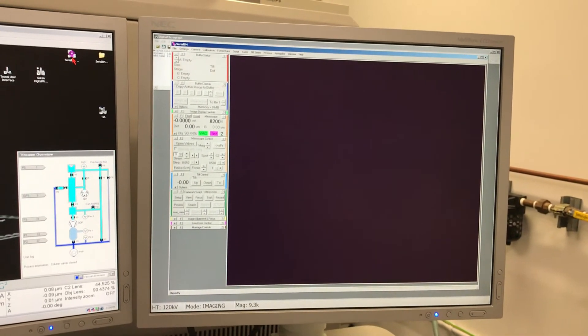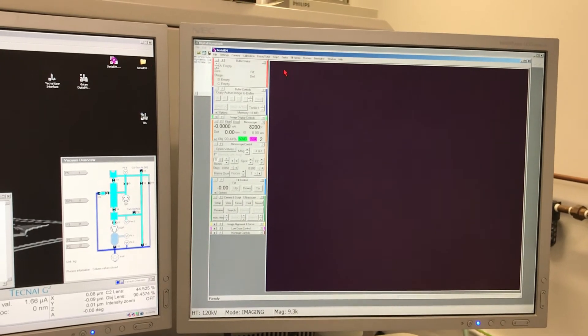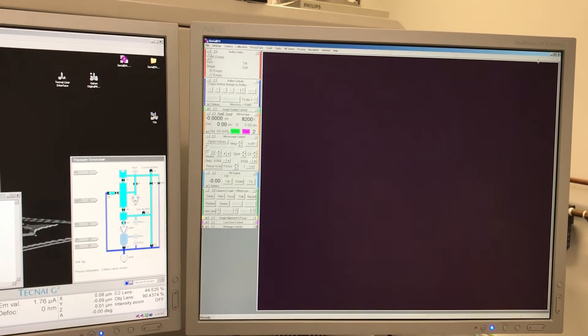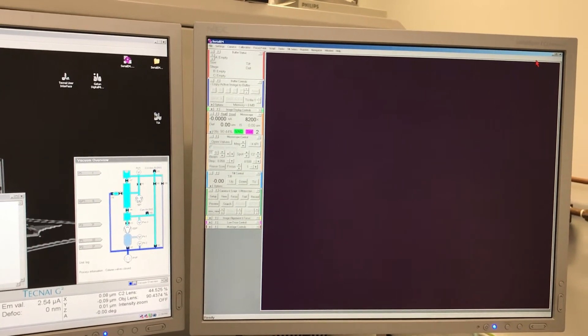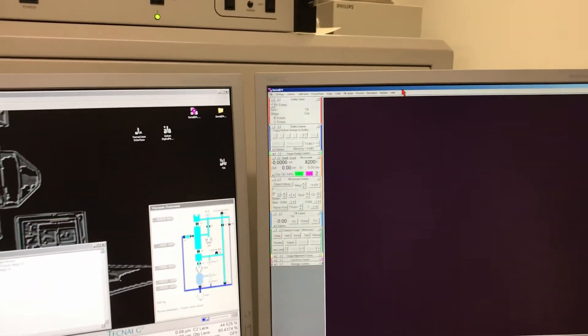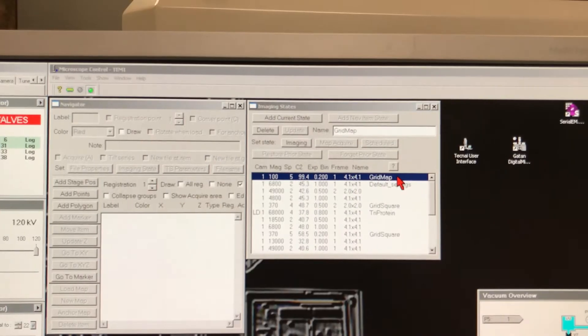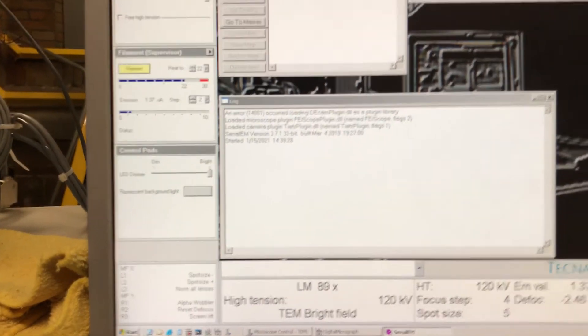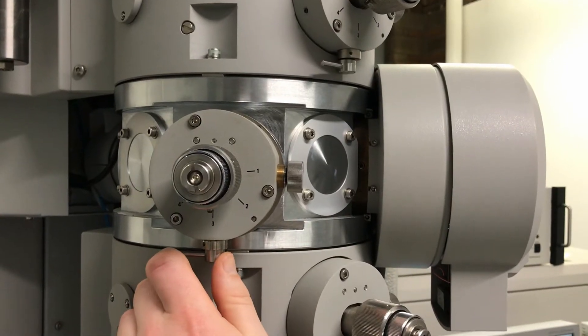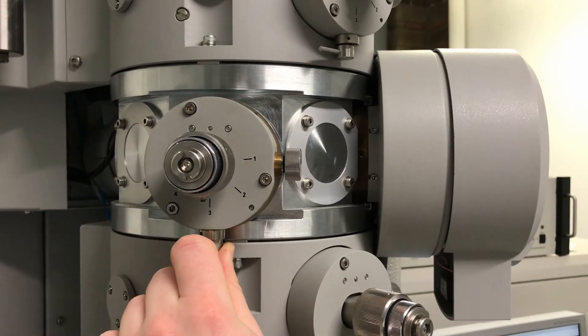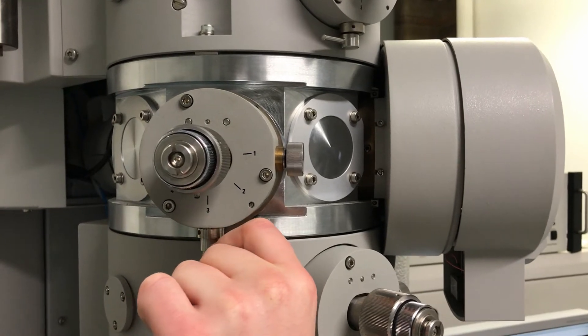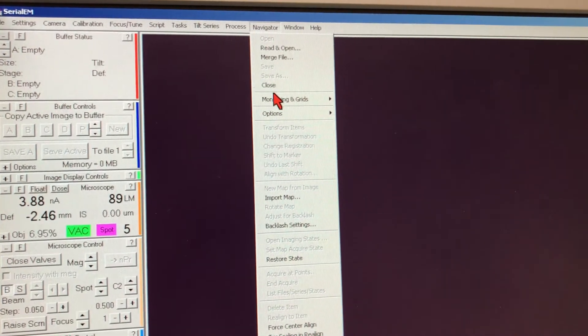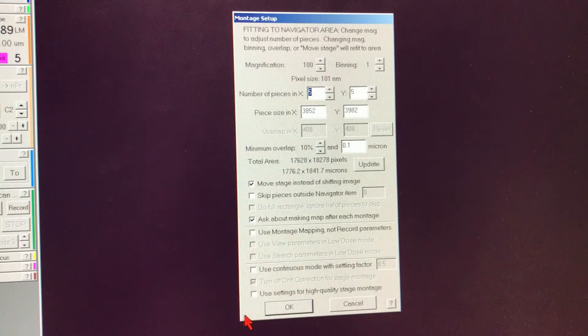The first thing we need to do is take a montage of the grid, which basically is an atlas of how the overall grid looks. The first step is to set up the right magnification on the microscope, which in our case is 100x, and at this magnification we can completely see the grid from one end to the other. The next thing we need to do is put on the right objective on the microscope. Then we go to the SerialEM software and under the Navigator tab and Montaging and Grids, there's an option called Set Up Full Montage.